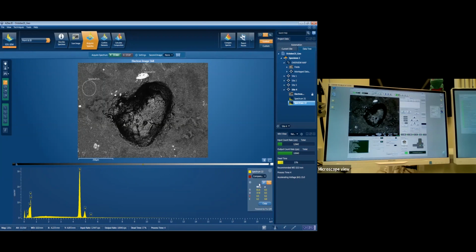So that's why it recalculates it and we use the weight percent. If we ever want to report data or share it with anyone or talk to other scientists about stuff, we have to make sure that it's in numbers rather than wiggles. Unfortunately, the wiggles are nice to look at, but they're not particularly useful in terms of science. So it's qualitative rather than quantitative, which I always struggle to say.